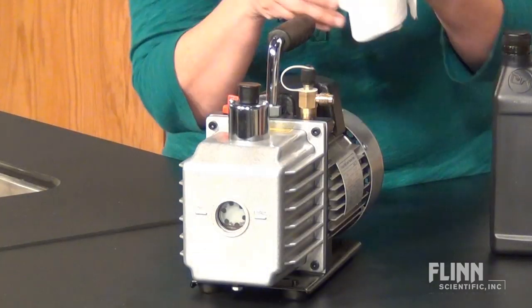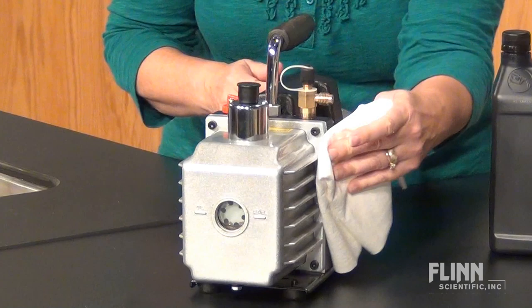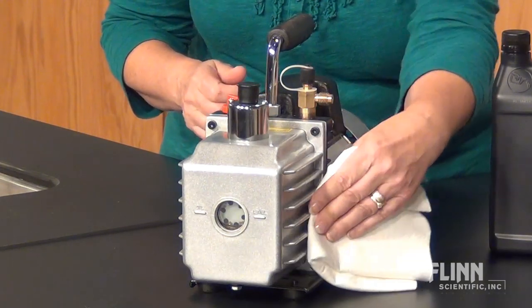Your vacuum pump is a great demonstration tool. Keep it in great shape with the following maintenance tips. After each use, wipe off the outer surface with a clean soft cloth to remove any oil or dust.